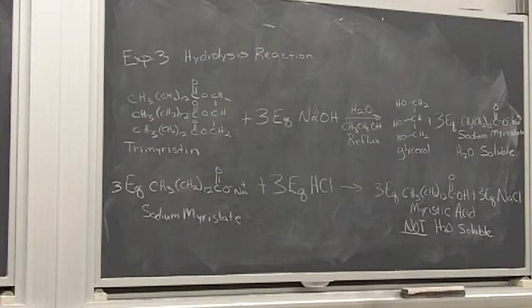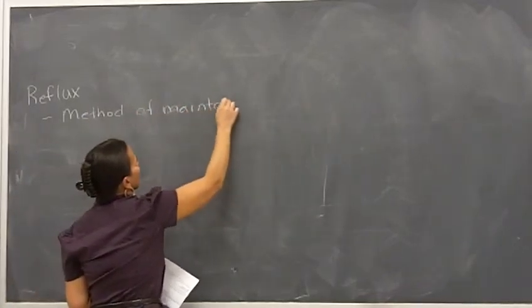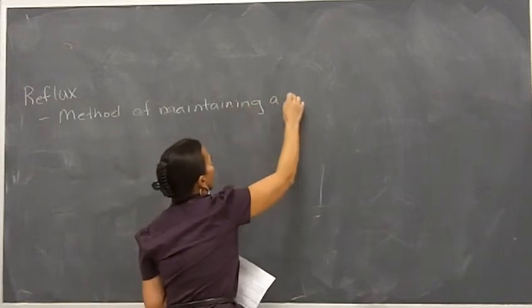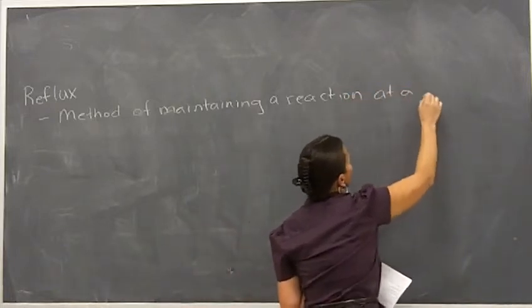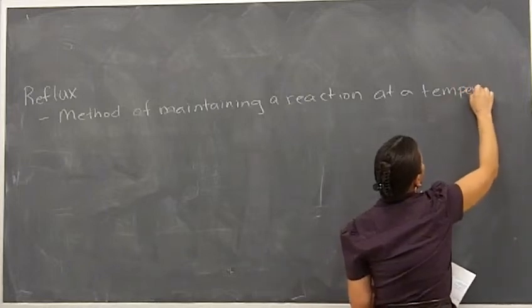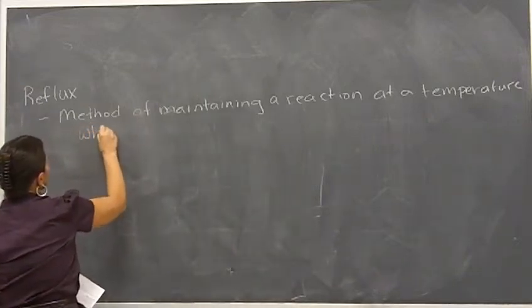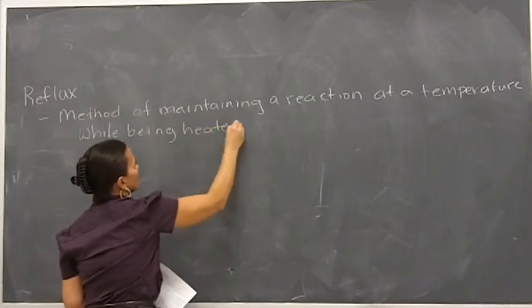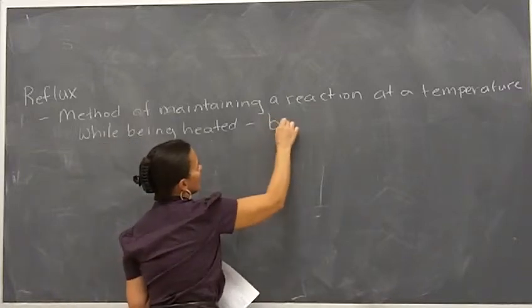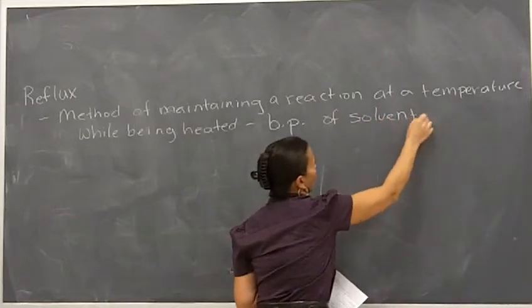And so reflux is a method of maintaining a reaction at a constant temperature while being heated. And that constant temperature is the boiling point of the solvent for the reaction, okay?